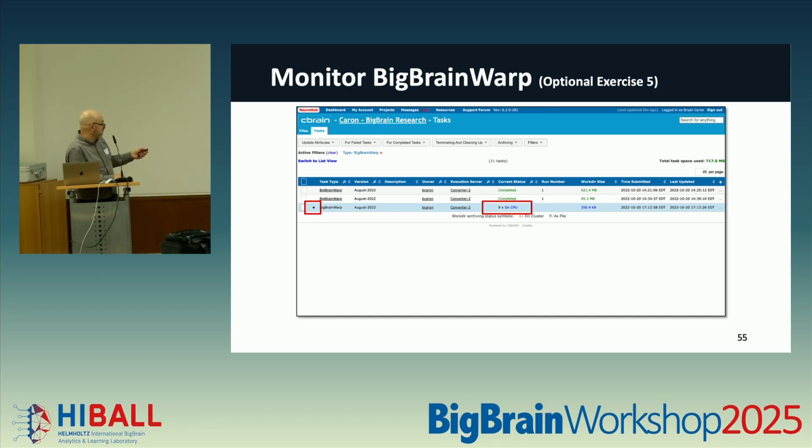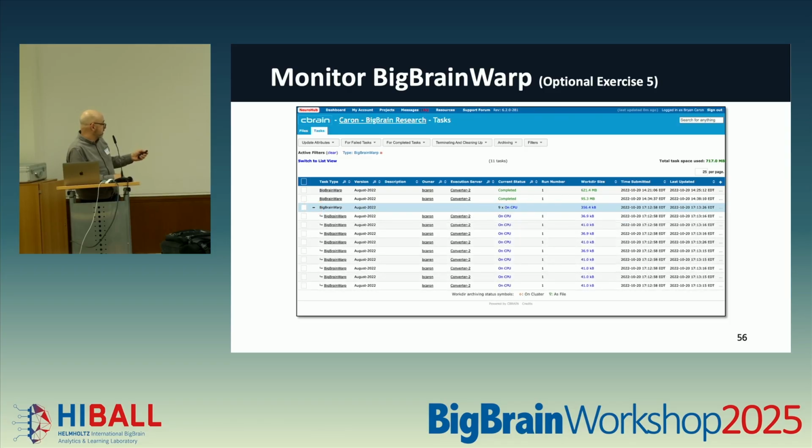And with that, if you click on the plus, you can actually get an extraction that shows each individual one. I know that your group here didn't see the plus, but were the other people not seeing the plus, or was the plus there? No plus? No plus? No plus. Okay, I'll have to double check why that was the case, because I ran it before.